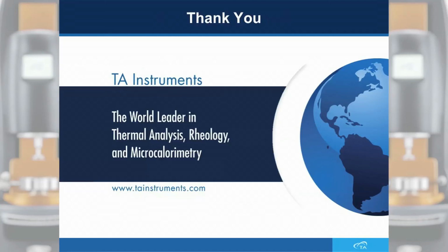This concludes the DHR QuickStart e-training course, which covered the basics of DHR and TRIOS operation and demonstrated general experimental procedures required for analysis. Thank you for attending.